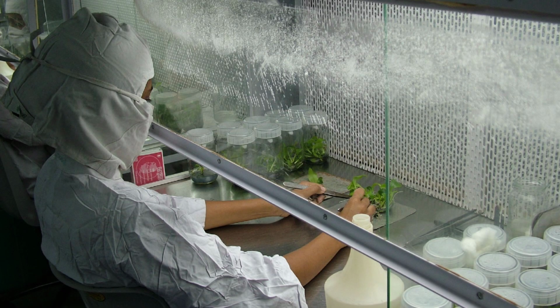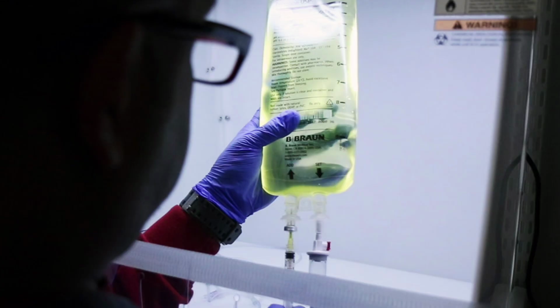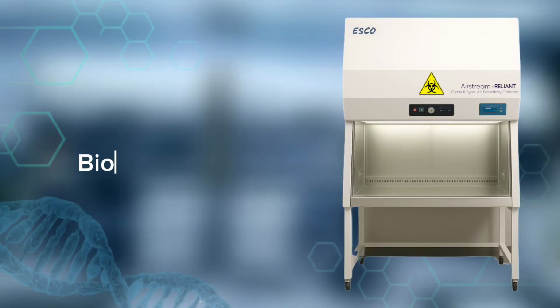So, what kind of operations can take place inside of an LFC, taking the previous information into consideration? Some operations that take place inside of an LFC are non-hazardous processes, such as media preparation, plant tissue culture, sterile non-hazardous work like compounding IV, antibiotic admixtures, and transferring sterile solutions from manufactured packaging into syringes for patient administration, and other sensitive equipment. In general, I would say that laminar airflow cabinets are more used in pharmaceutical applications than in cell culture.